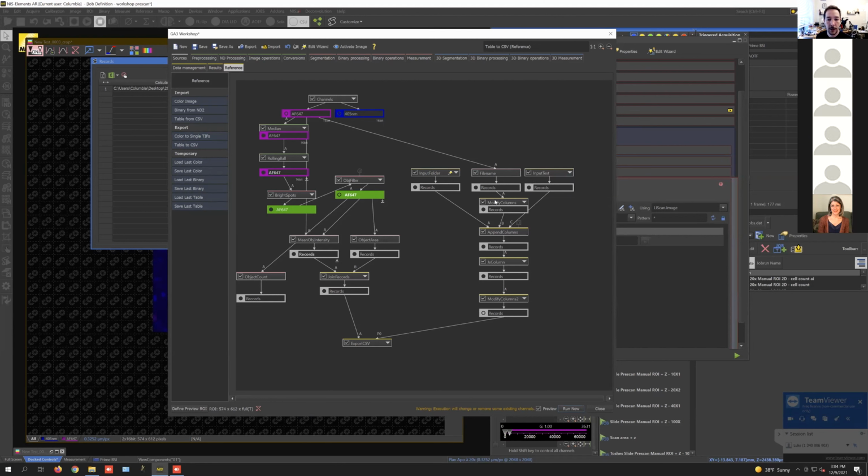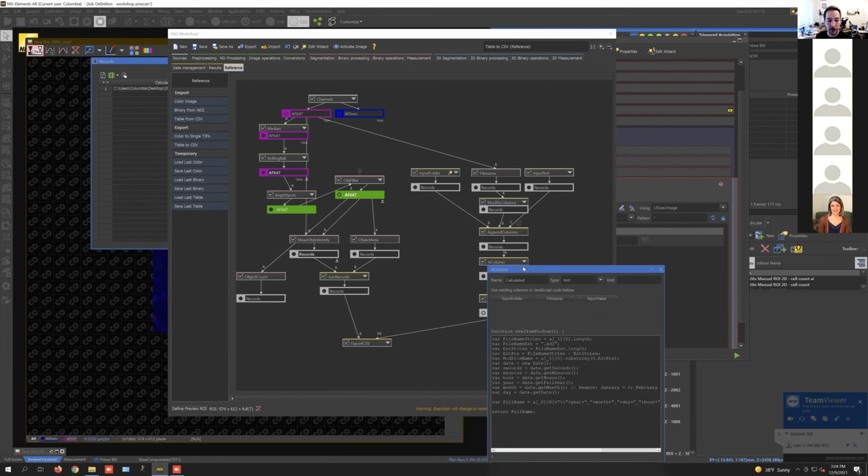And these steps below here are basically modifying the column so that I can show you. So we're just getting the file name, not any other information. And then it runs a little bit of JavaScript in here to basically get the input folder, get the file name, get the CSV and put them all together into a single string. And in fact, I've just modified this one here to put a timestamp on the file because jobs are still kind of under development, and we don't always get a file name by doing this.